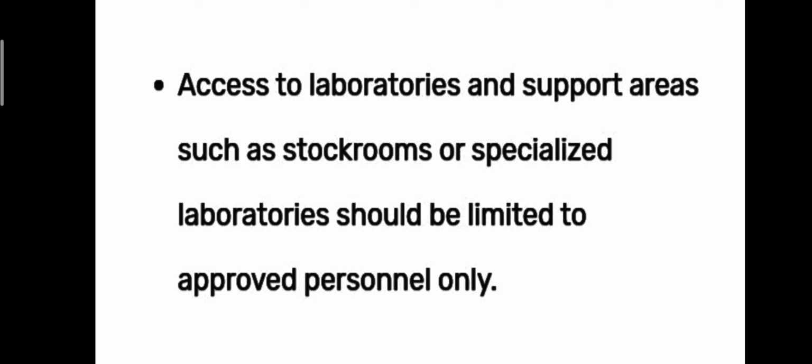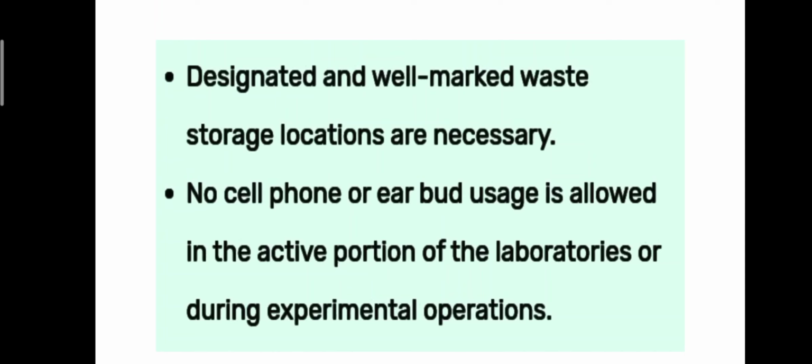Access to laboratories and support areas such as stock rooms or specialized laboratories should be limited to approved personnel only. Designated and well-marked waste storage locations are necessary. No cell phone or earbud usage is allowed in the active portion of the laboratories or during experimental operations.